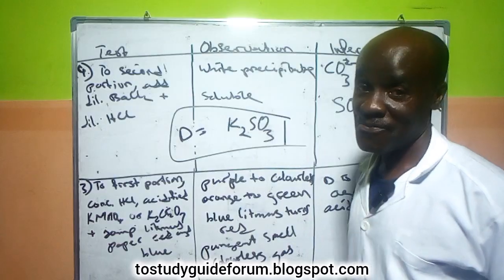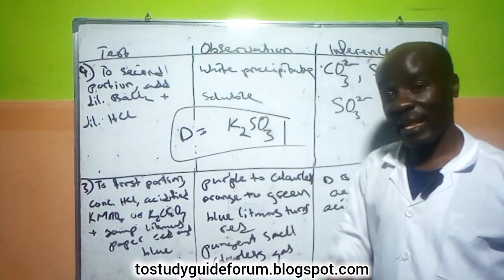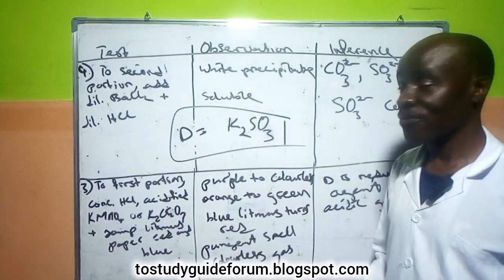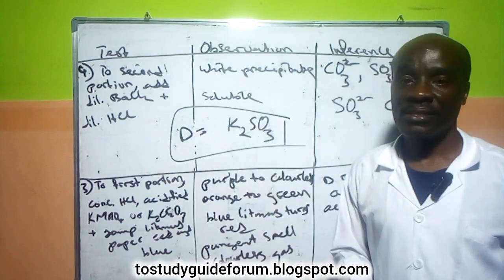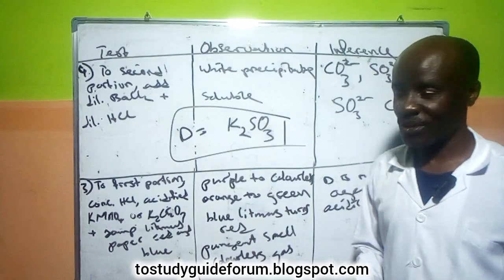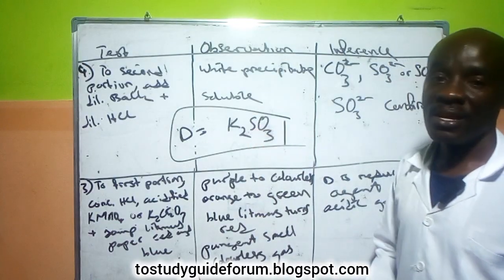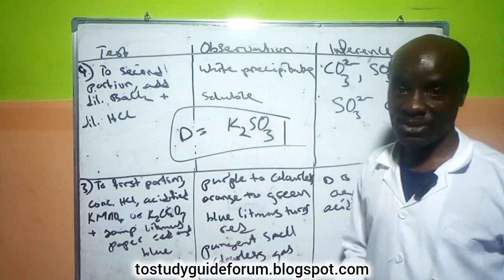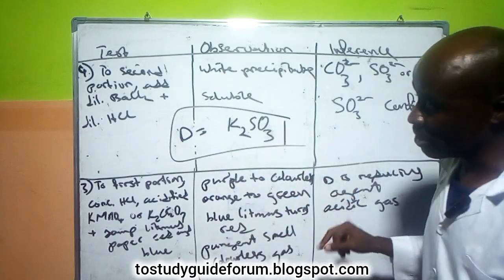That is what we have. That's what we're going to be testing. Potassium always gives us that lilac color in the flame test. For O level, it's just this thing that we normally use in testing for it. And then this other one is always a reducing agent. The gas is a reducing gas, that whenever you bubble it, I remember what I told you here.